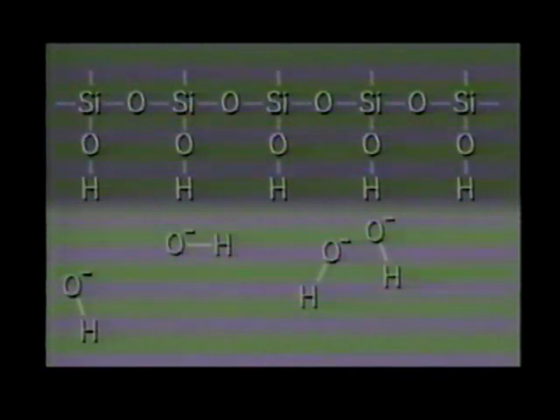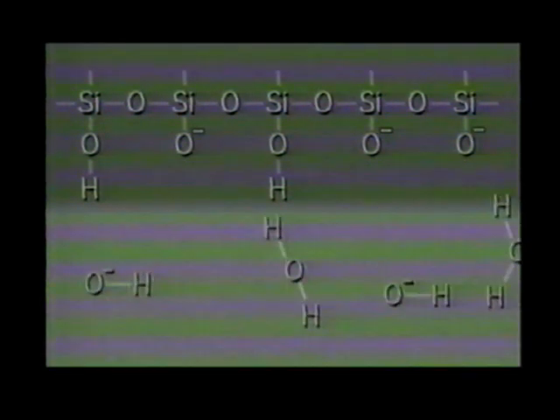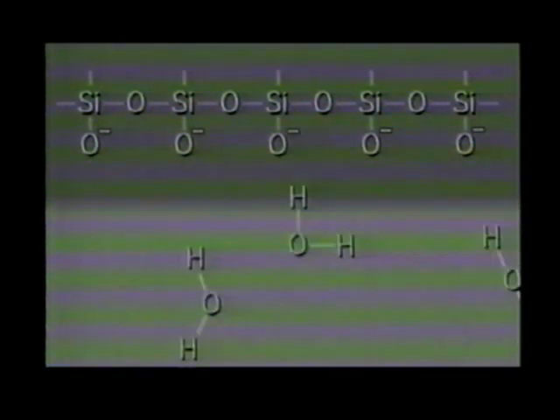An important property of liquids to which electric fields are applied is the induction of electro-osmotic flow, which provides a bulk movement of solvent towards the cathode. With a silica capillary at high pH, deprotonation of the silanol groups on the inner wall of the capillary results in the wall becoming negatively charged along its length.